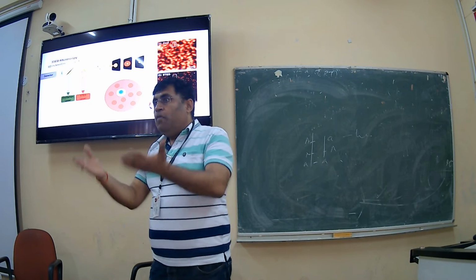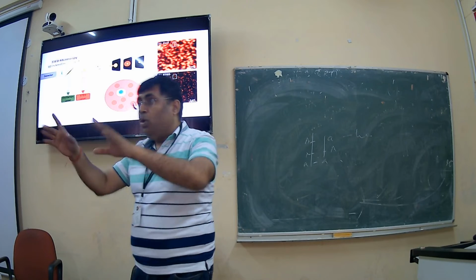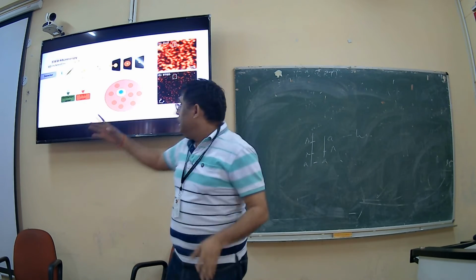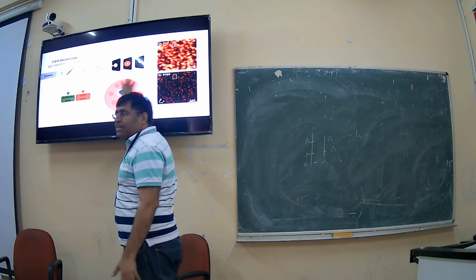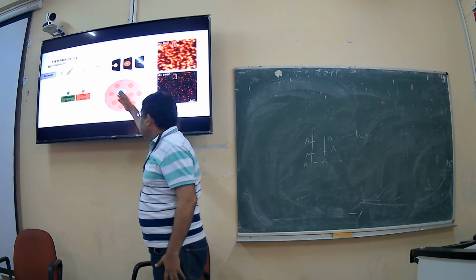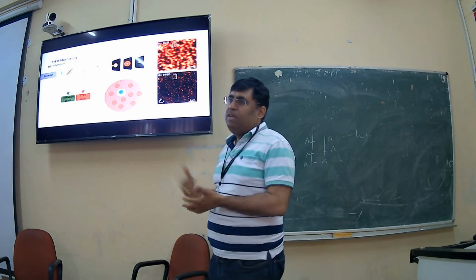Okay, so what I will do is, if I ask a question, I keep everyone quiet and say don't say anything, and then I ask one person at a time. In the same way, this laser will block or decrease the fluorescent signal of the other molecules, and then one at a time you will see only this one. Then this one will be covered and empty, so that you get the image, capturing it in a very short time.